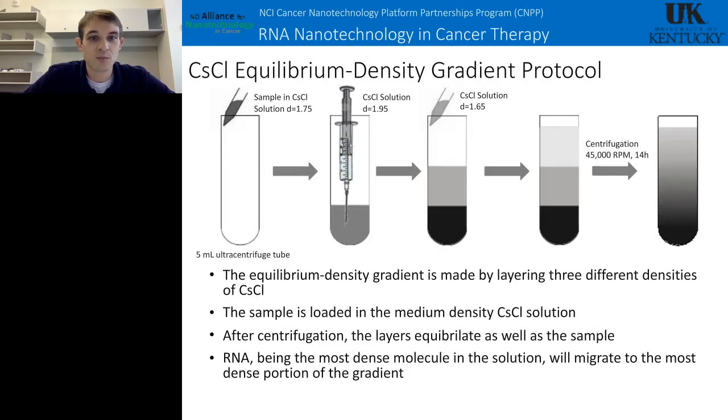So here's a somewhat detailed protocol, like I just mentioned earlier. Some important things to remember when doing this: you want to pipette these solutions in very slowly. You don't want to disturb the gradient in between each, because that will affect how well your density gradient forms while centrifuging. And that's the most important part, because as your gradient forms, your particles move with the gradient. So if you have a very uniform gradient, you should get a good purification of your RNA.